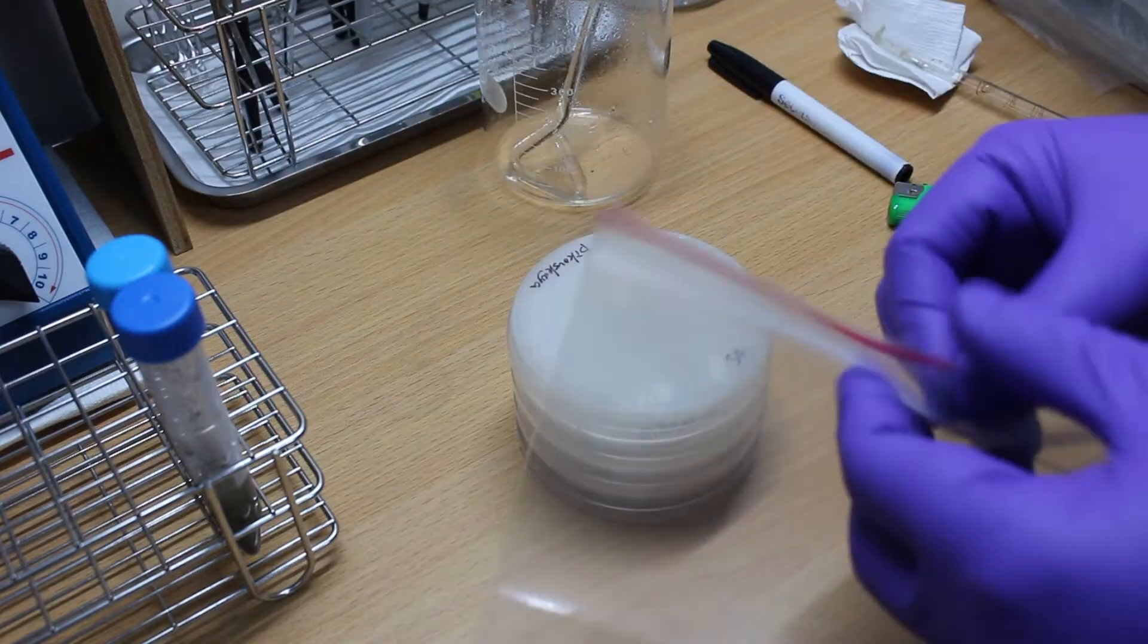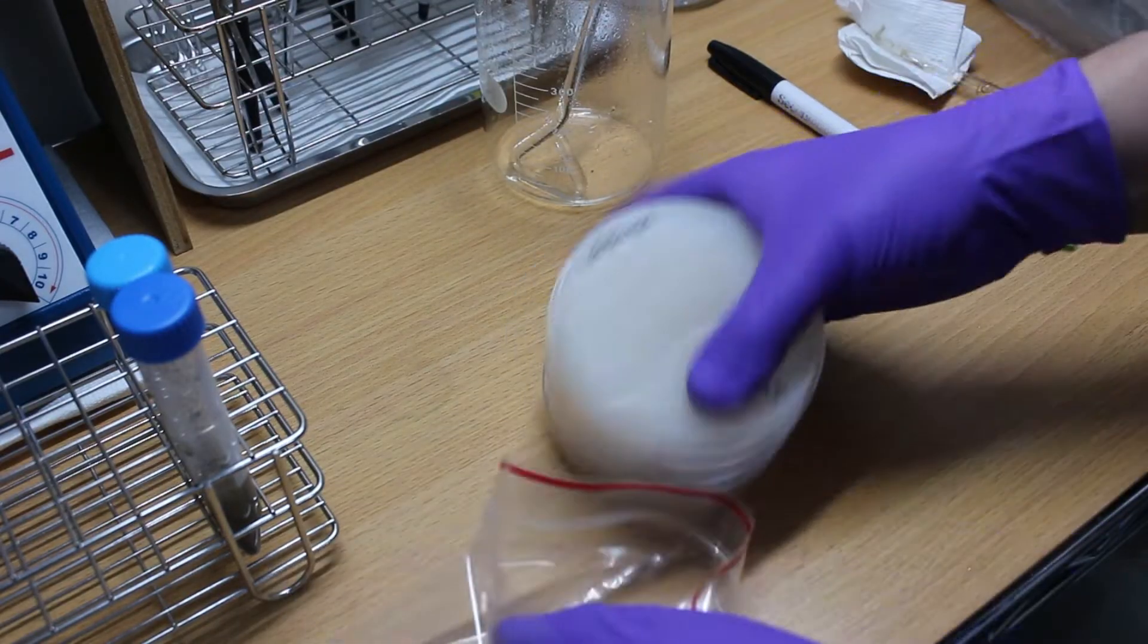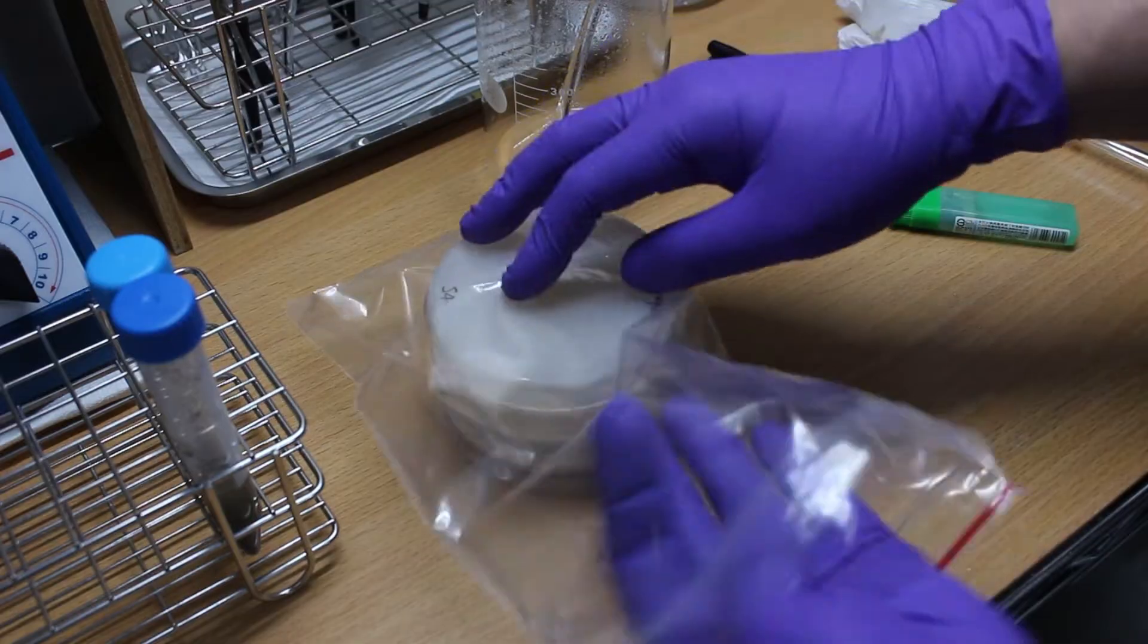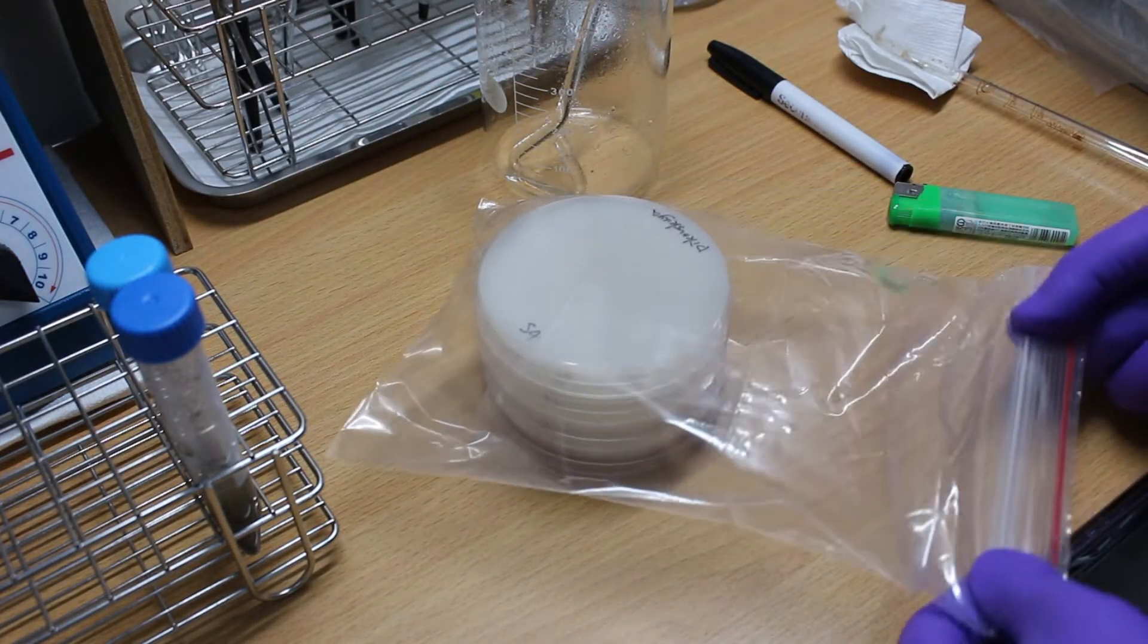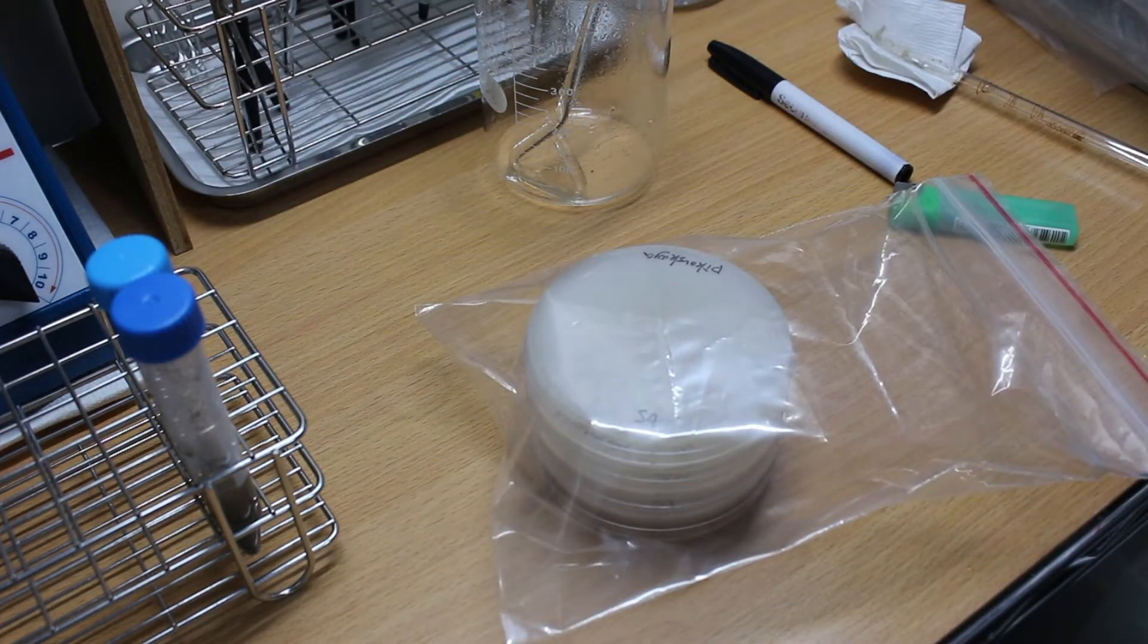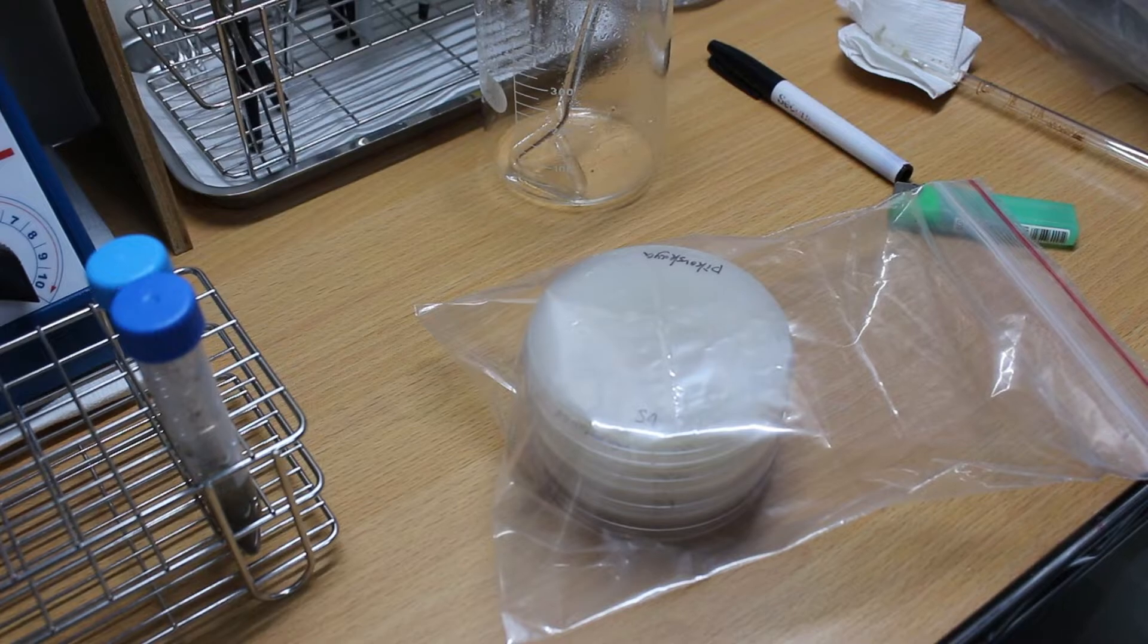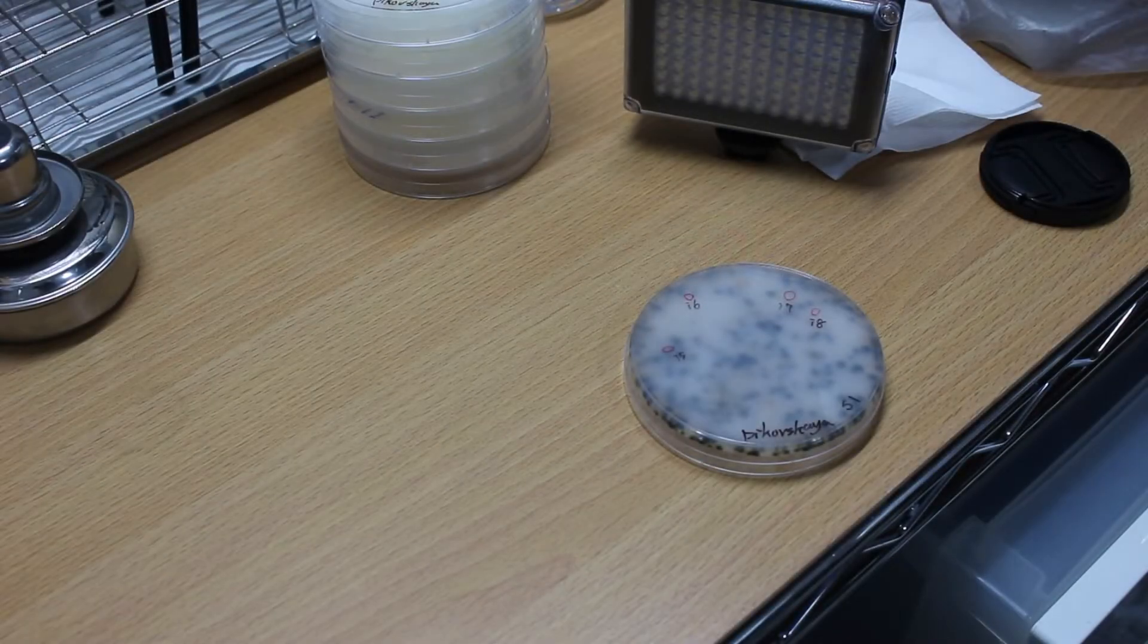After spreading the sample, flip the plate over and put it in a bag. I didn't need an incubator because I want to find bacteria that can grow at room temperature. It will normally take 2 to 3 days for the bacteria to grow.